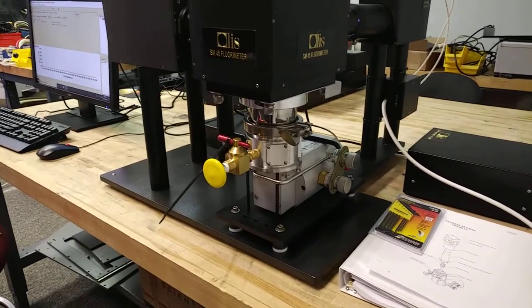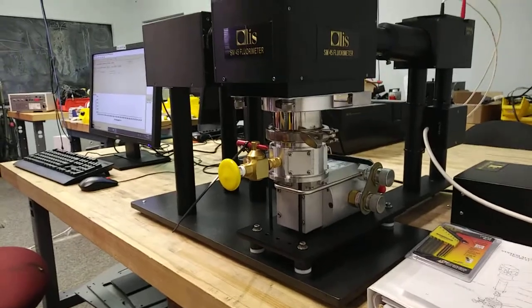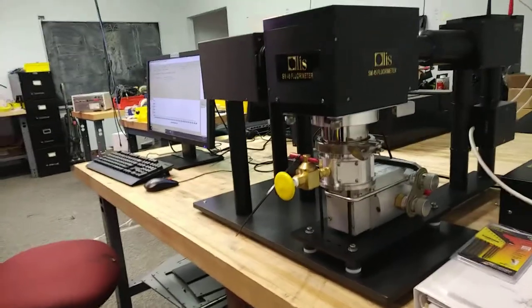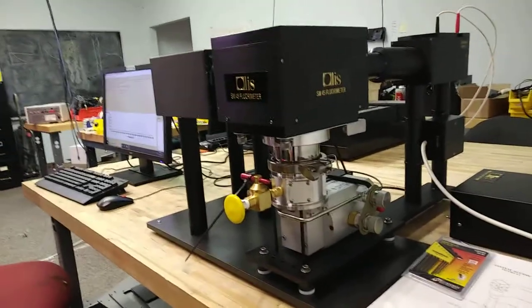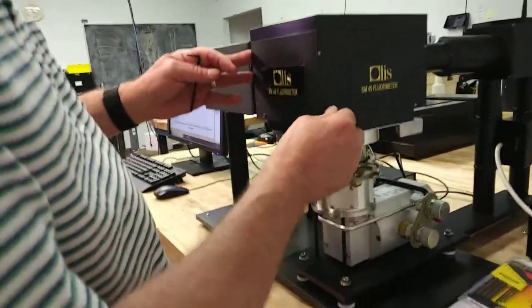The Olis SM45 with the cryogenic flask, and Rich, our engineer, is going to show us how to access the cryogenic system and move things around. So what are we doing, Rich?